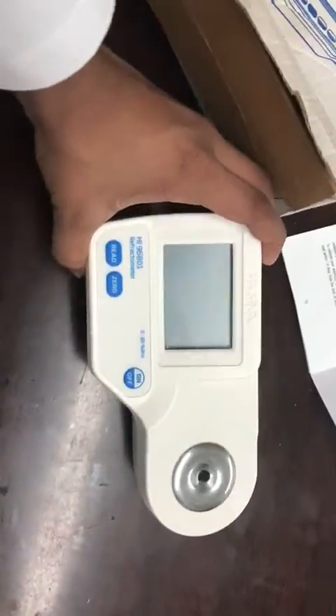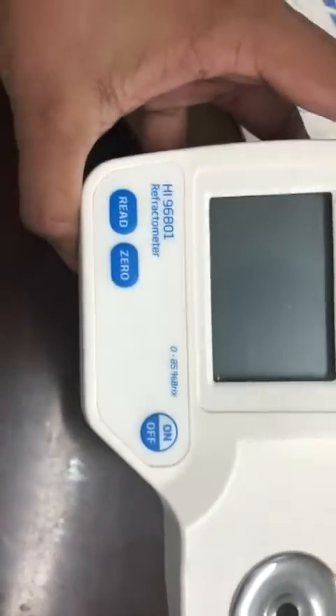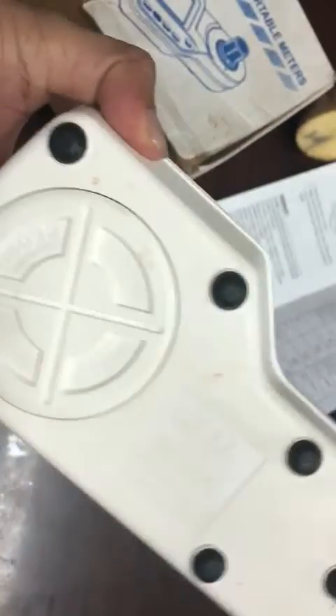Hello everyone. Here we introduce an efficient and simple way of sucrose determination using a refractometer. Here is a demo for you.